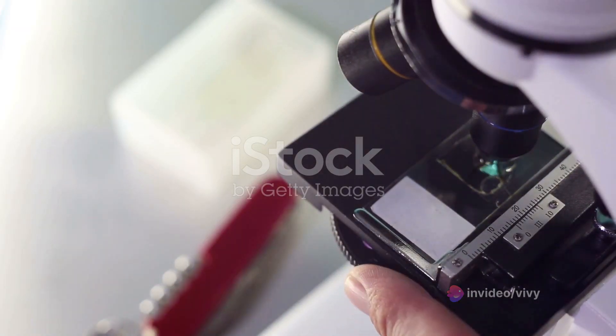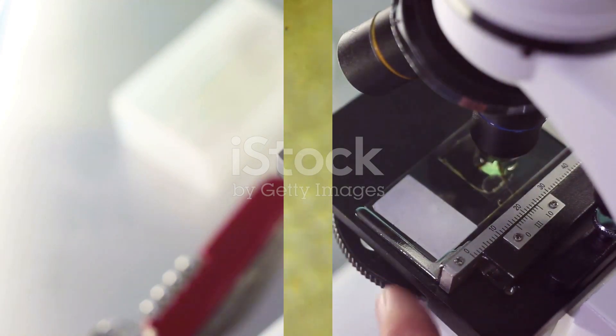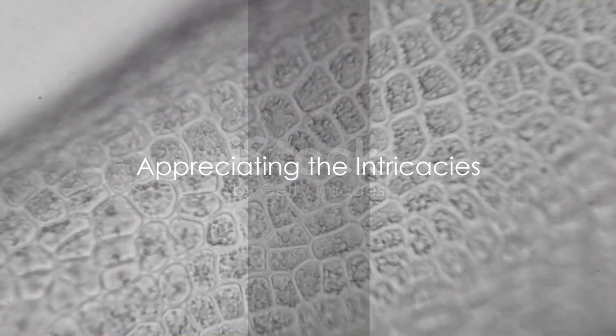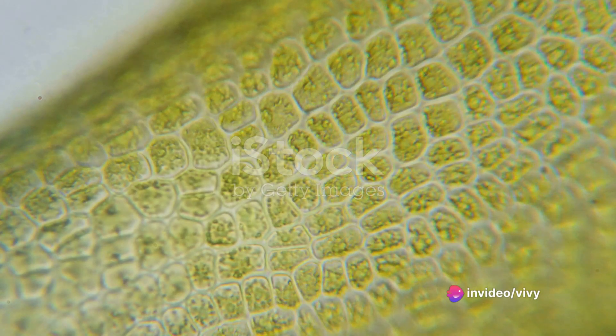Remember, never use the coarse focus knob when viewing at high power, as it could damage the delicate lens. Finally, you are now looking at a world invisible to the unaided eye — the intricate structure of a plant cell.